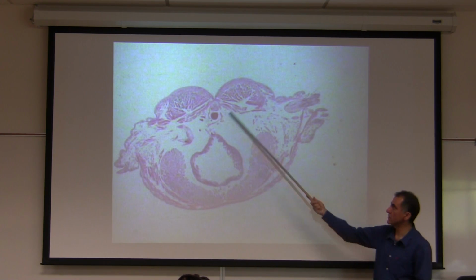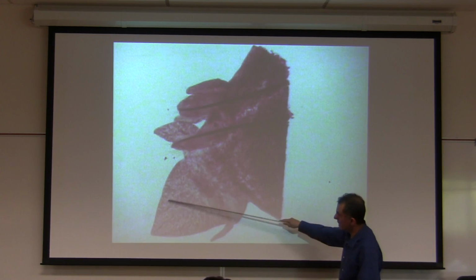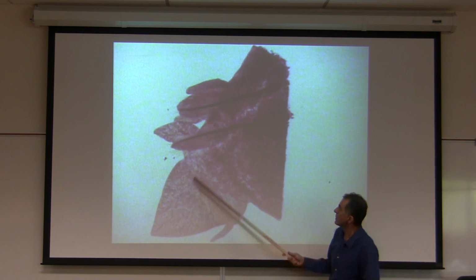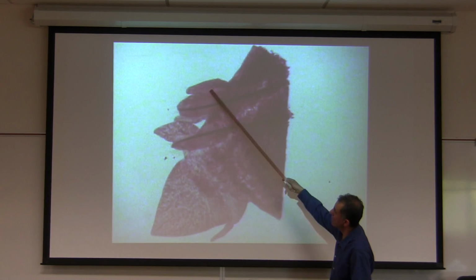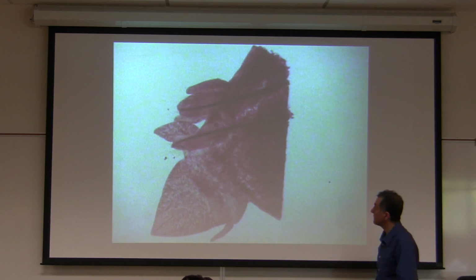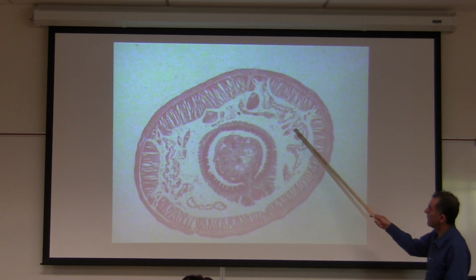What is the name of structure? It's a blood vessel. Same thing again. Okay, very good. Now, right here, this structure is notopodium, and all of these guys are neuropodium. And aciculum is right here. You have setae. Earthworm, same thing again.